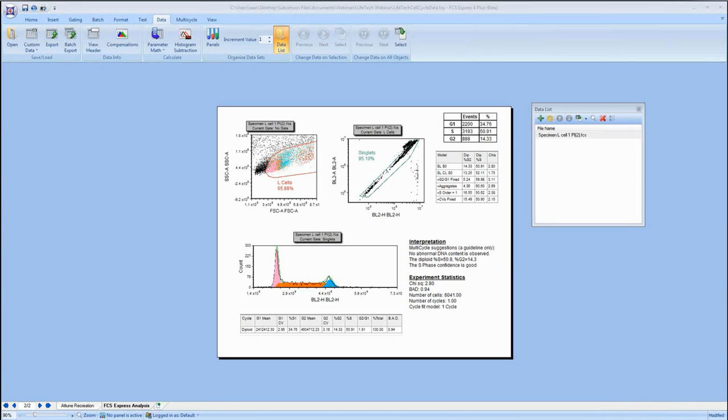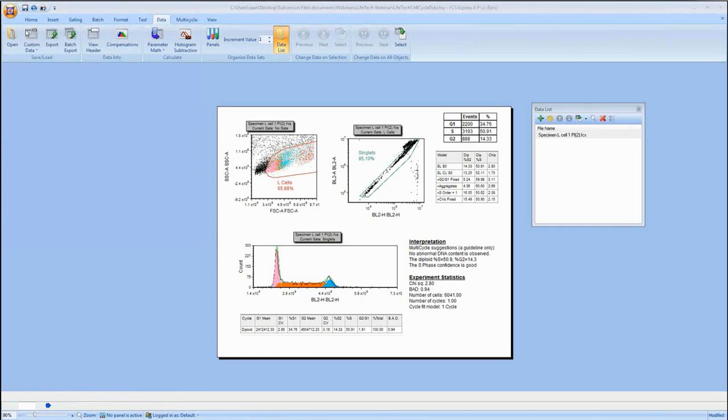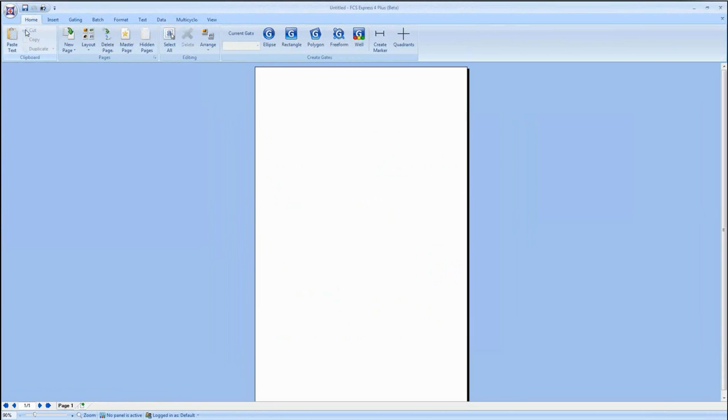So what I wanted to move on to quickly was working with immunophenotyping data in FCS Express. I'm going to show you some of the Attune data, but I'm also going to show you some examples of some other immunophenotyping assays that we spent a lot more time working on to actually put these things together. But what I have here, I'm going to open up a new layout, is again a similar data set, except it's a 6-color immunophenotyping assay.